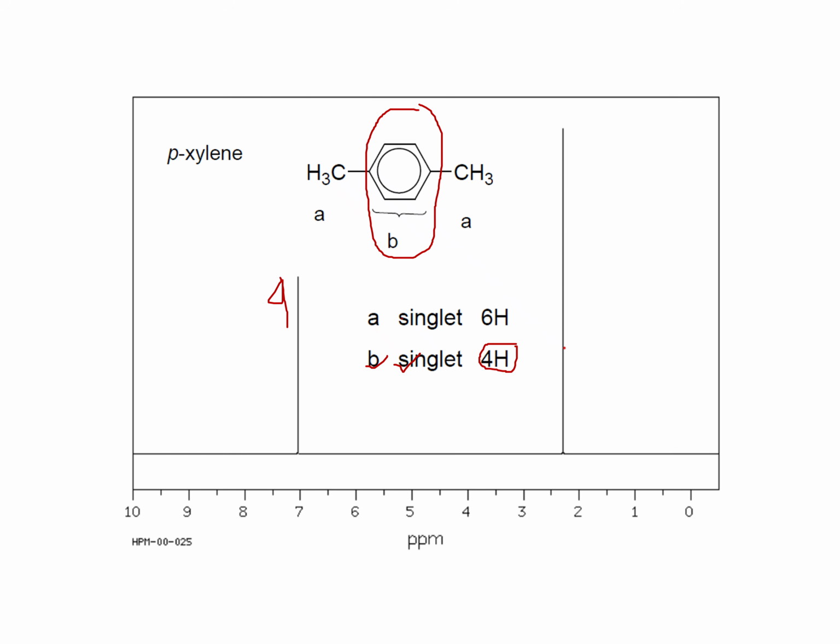So just put the scale. If you put the scale, its height would be 4 and the other height would be 6. Okay, then look at the CH3, it would be singlet. Because what? Because all the benzene's hydrogen are in one environment. So okay, it would be singlet.